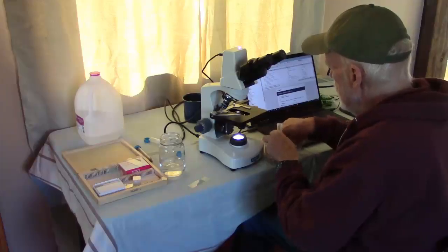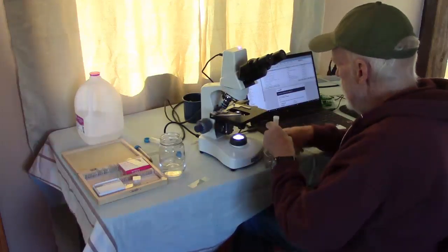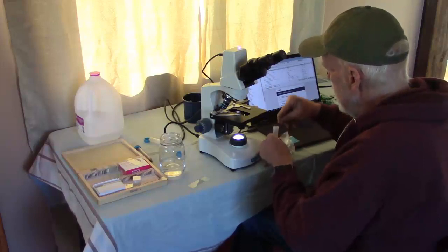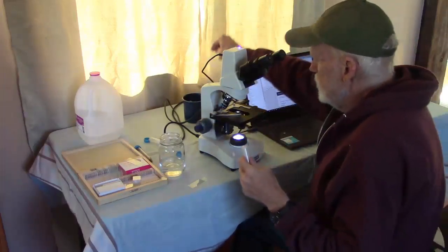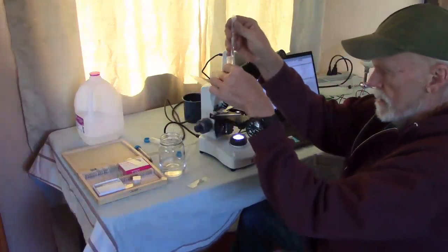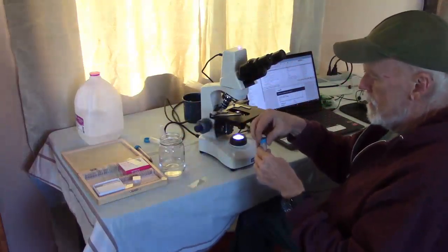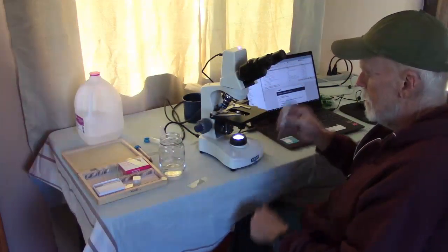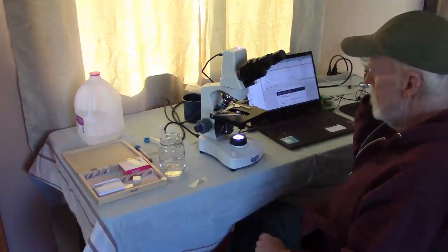If you have a proper microscope, the first thing you need to do is prepare a sample. To make a sample, you'll need a test tube with milliliters marked on it. Put in about 1 milliliter of soil, and then add enough distilled water to bring it up to 5 milliliters, so you have a 5 to 1 solution. Put the cover on and shake it for 30 seconds. You don't want to do it too hard where you're going to smash the fungi, but you want to do it enough to remove any soil life off of the organic matter so you can see what's in there.